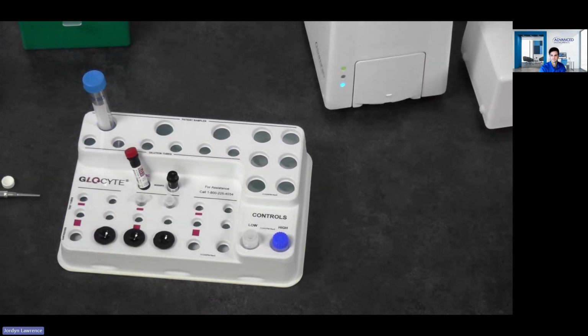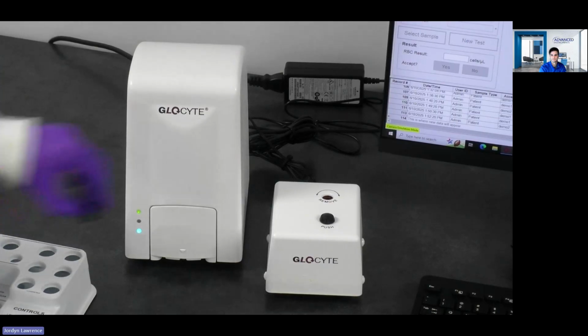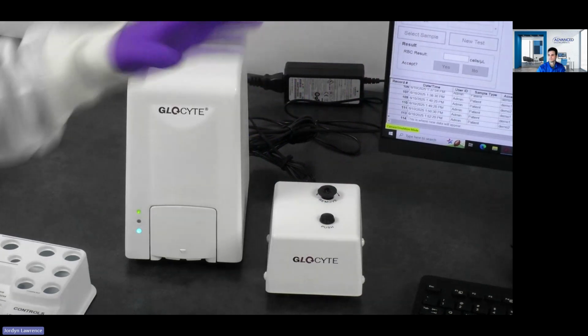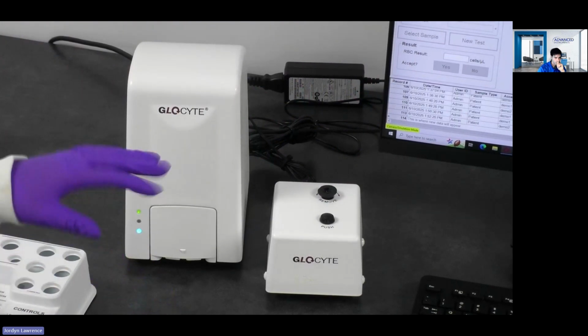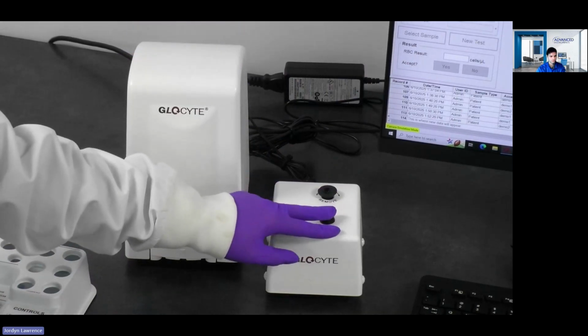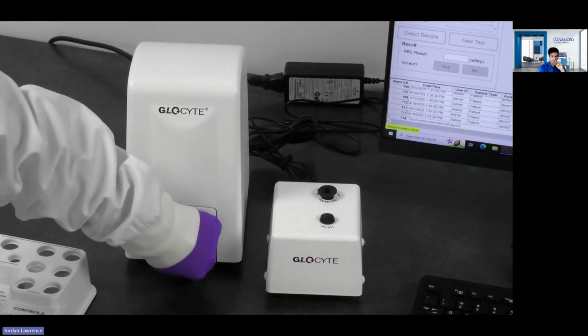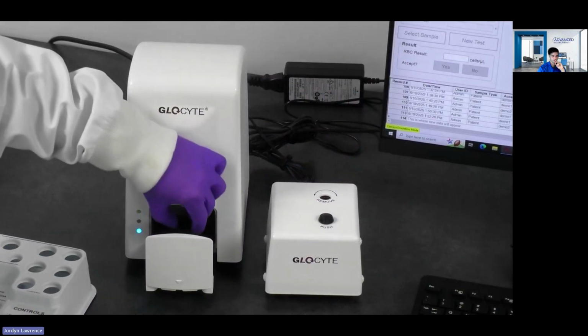So I'm going to bring you over to the vacuum station. And what's going to happen in the vacuum station, I'm going to set it off here. And you'll see all the sample on the top. But the vacuum station is going to suck that down. So all the cells remain on top of the membrane for the GloCyte to be able to test. I'm going to press this really fun button for approximately 10 seconds. You'll see the sample go right down through. And then you'll know it's ready to get popped right into the GloCyte.